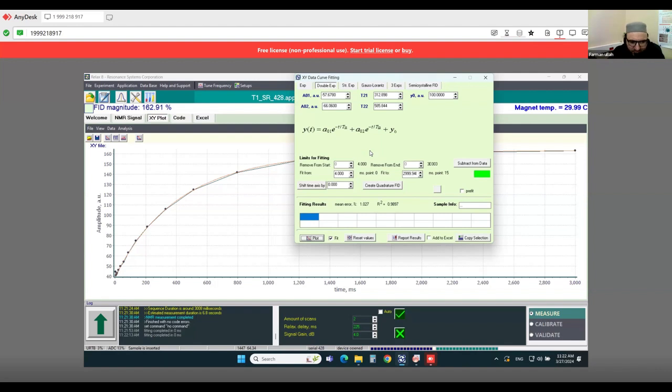So here, this is the one thing. And the second thing, this is by mistake. You will see here T2, but this is a mistake in developing the software. This is the T1 value, by the way. So we saw here that we have the T1 value 0.43, and hopefully if we have time, we will compare this value with the FFC data that the professor represented and Dr. Ella already has.